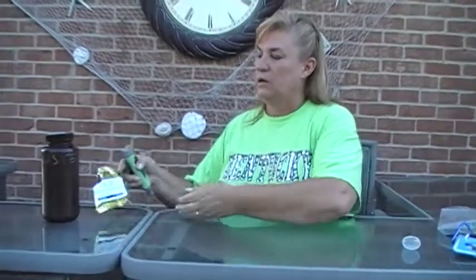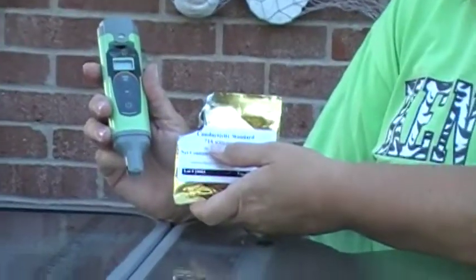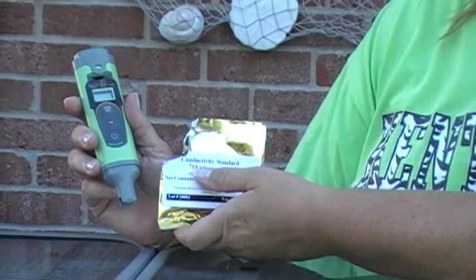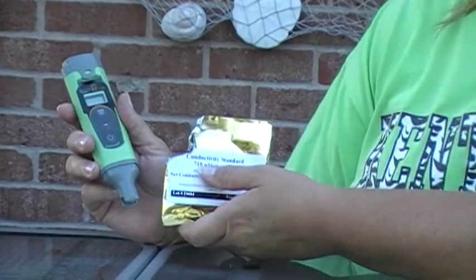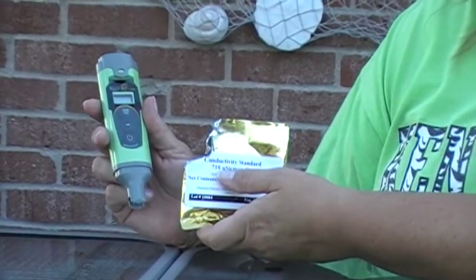So what you want to do is take the cap off of your meter. Get your conductivity standard. You'll notice that the standard says 718. The conductivity meter reads in increments of 10.